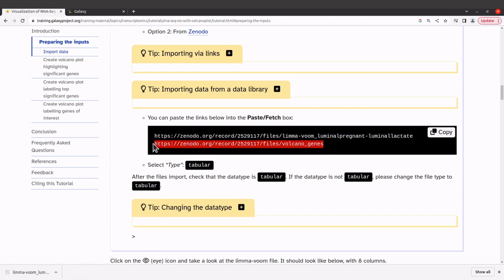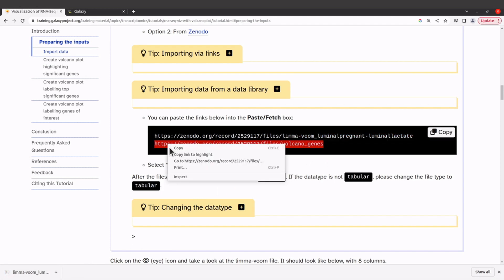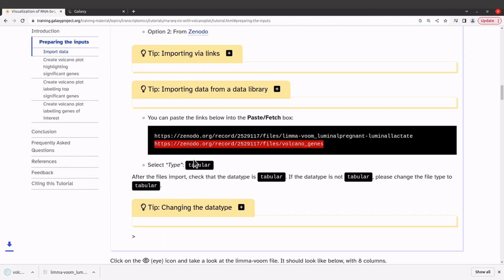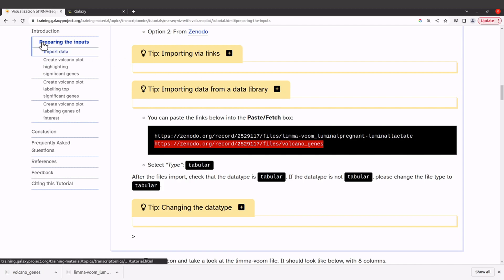I'll also download the second file the same way. Now I have all of them downloaded, so let's check them out.